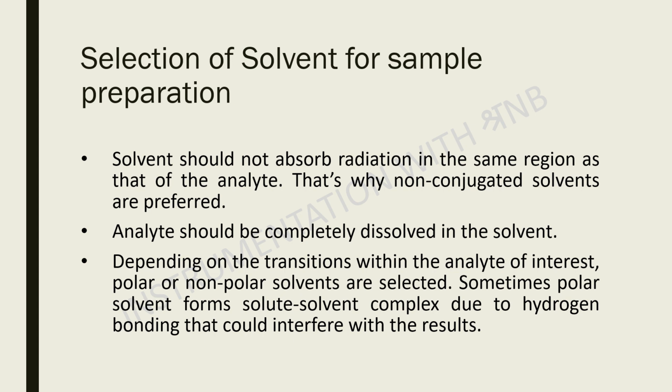Second, the analyte should be completely dissolved in the solvent. No suspended particles should be there, to avoid reflection or scattering phenomena. And the third one is, depending on the transition within the analyte of interest, polar or non-polar solvents are selected. That I'll discuss later.